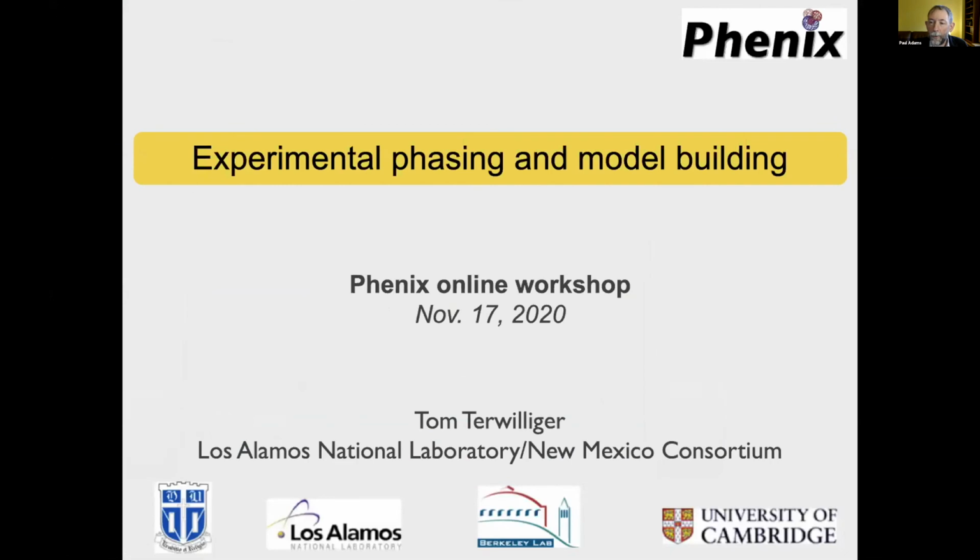Somebody's asking about data processing programs. Well, we do actually distribute DIALS, as Billy said. We don't have a GUI with that right now, so it can be run from the command line, but we do want to have some interface to DIALS in Phenix in the future. Randy's just reiterating, yeah, if you report a bug, please make sure you've given us your proper email address. Otherwise, we can't get back to you, and you can actually set that up in the preferences so you can make sure that it's right. Yeah, and Billy's just saying that we ship DIALS 2.2 as part of Phenix currently.